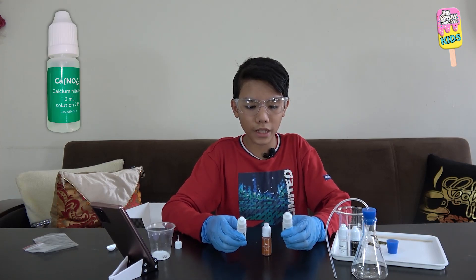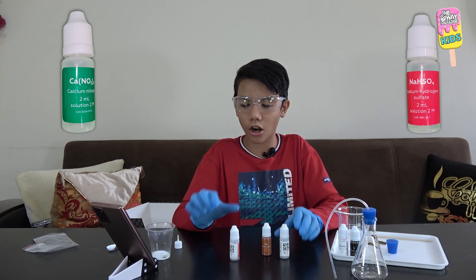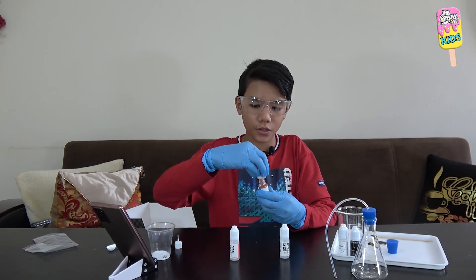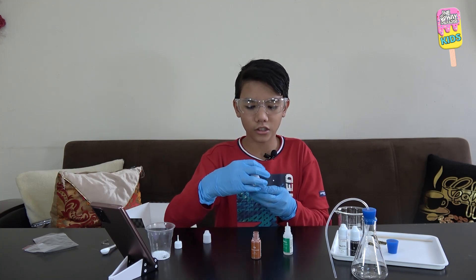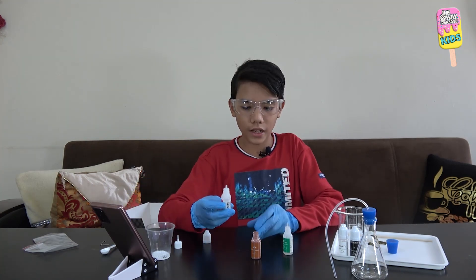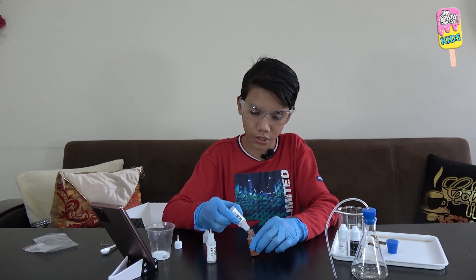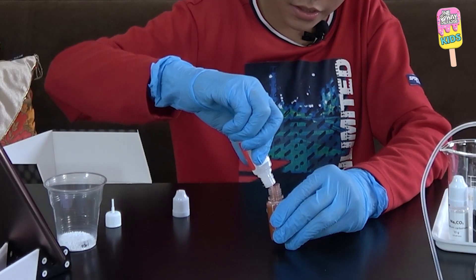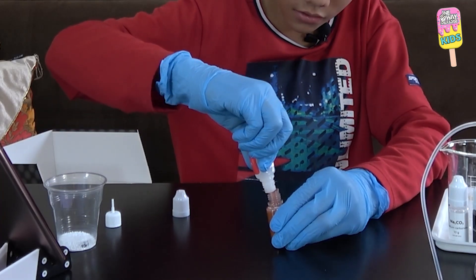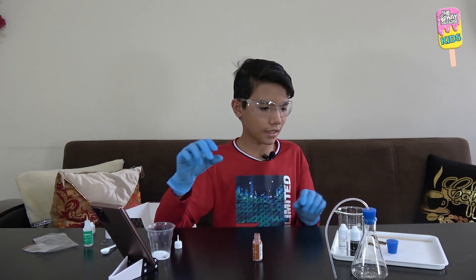The next step is to pour some calcium nitrate and sodium hydrogen sulfate into the copper solution. I will open the copper, get the calcium nitrate and the sodium hydrogen sulfate, and pour the calcium nitrate into the copper, then the sodium hydrogen sulfate. I will stir it with the wooden stick for 10 seconds.